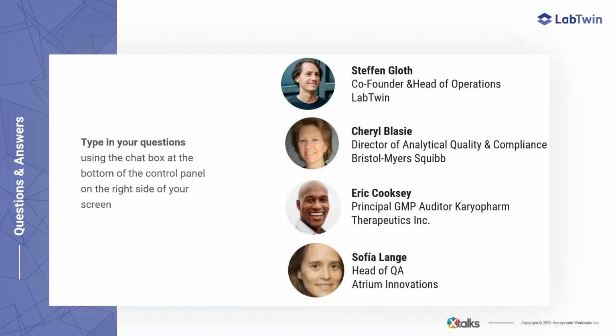But what we're seeing more and more of is those 3 or 4 labs might be distributed among internal and external testing sites. So that's my definition of a distributed quality control system.